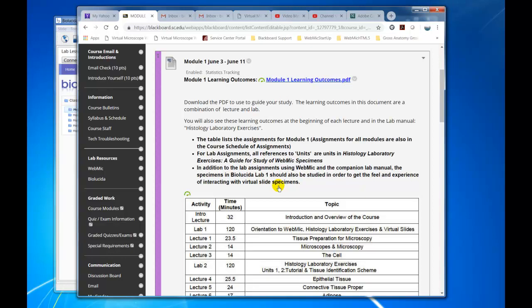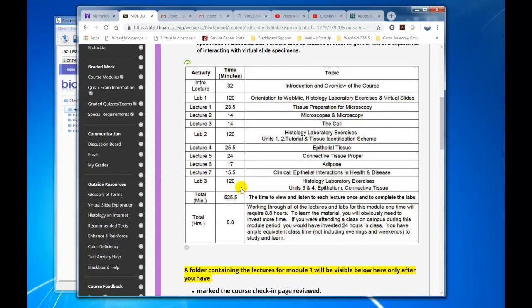They may be the ones you study, or they may be different ones, but as long as you stick to not trying to memorize images and then try to see that memorized image in a quiz or exam, but you learn the criteria that you have to remember to recognize one structure from another structure, one cell from another cell, etc., etc. And we have some videos that will guide you through that also. But this focuses on Biolucida.